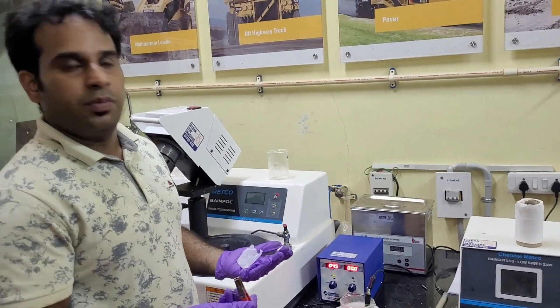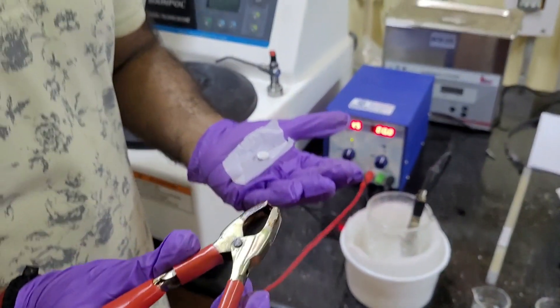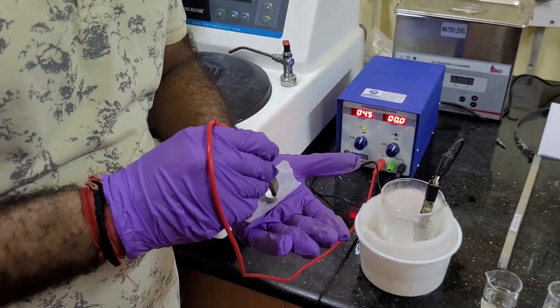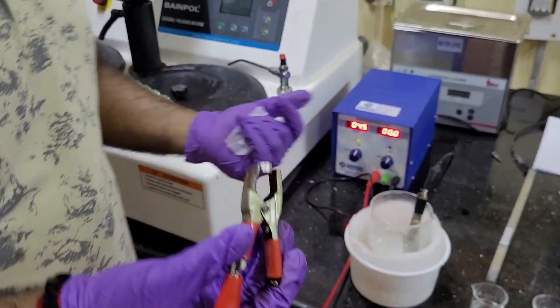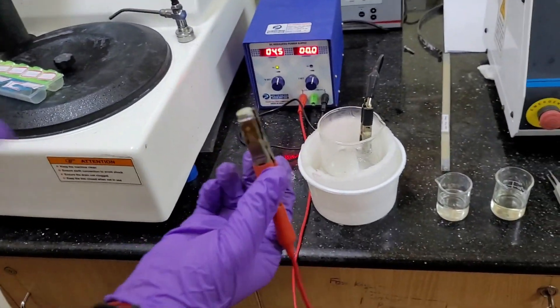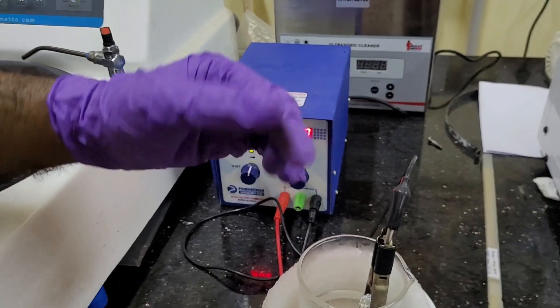Now, the next step of this electropolishing is, we have to hold the sample by using this kind of clips. And this is known as the anode. This is made as anode. So, now, before doing the electropolishing, the very important step is to optimize the electropolishing parameters.